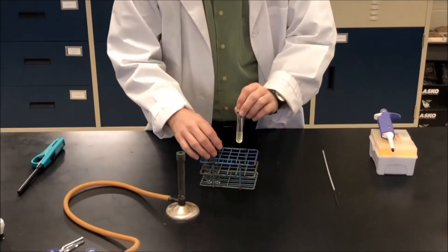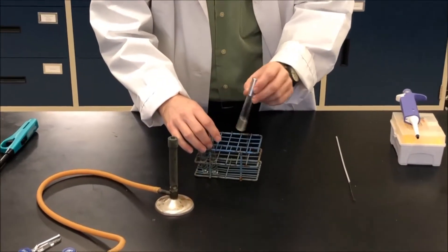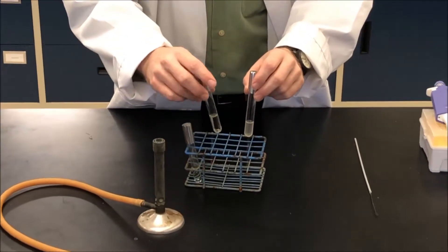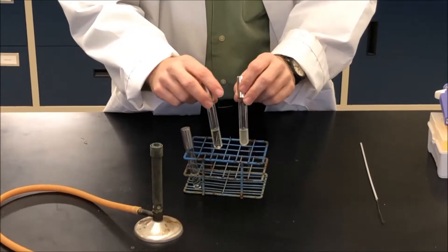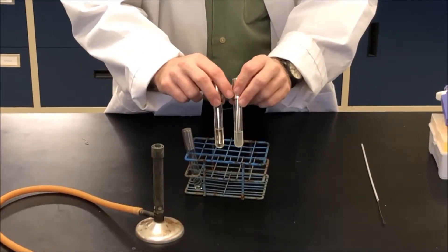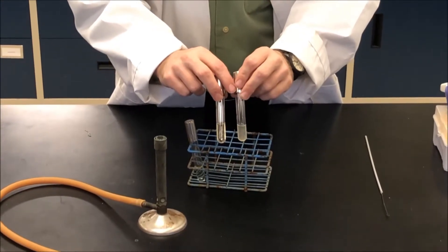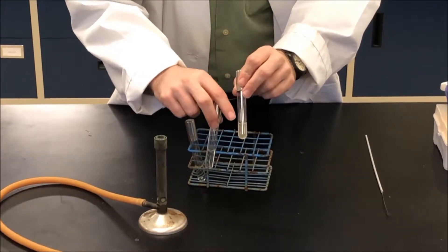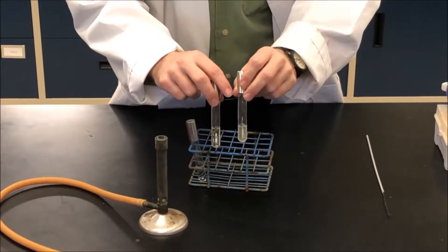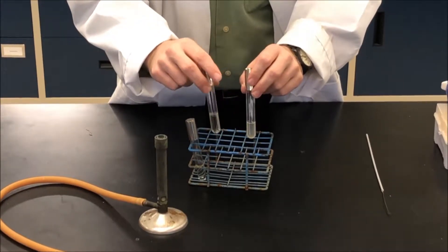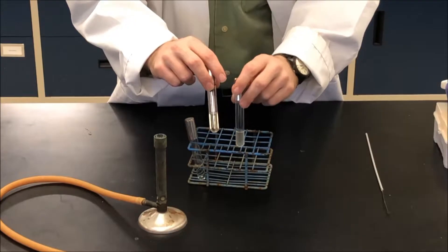To begin, I have a broth culture of some E. coli, and here I have some sterile Luria broth media. You can tell that the E. coli has grown given the fact that the liquid culture here is turbid as compared to the sterile media here, which looks clear.